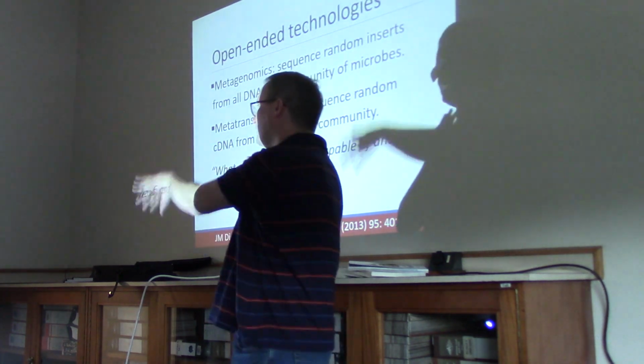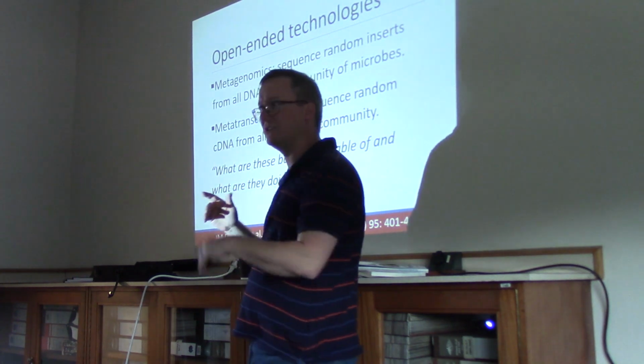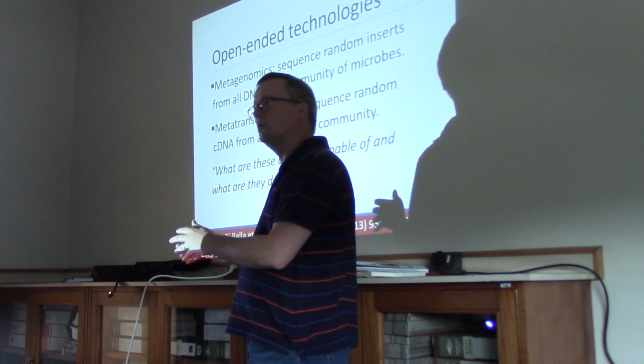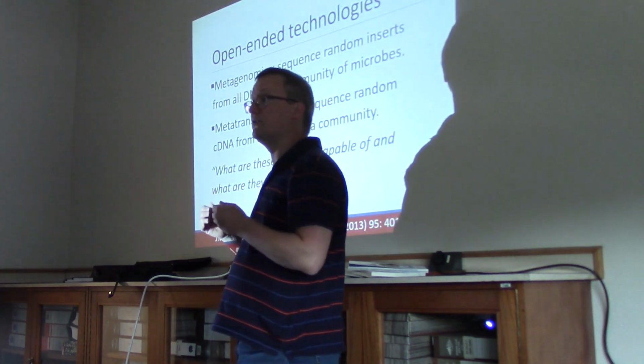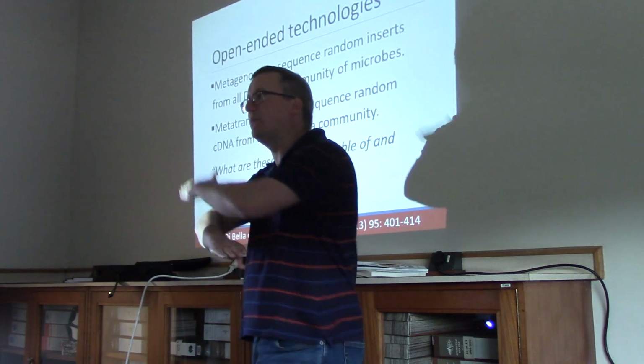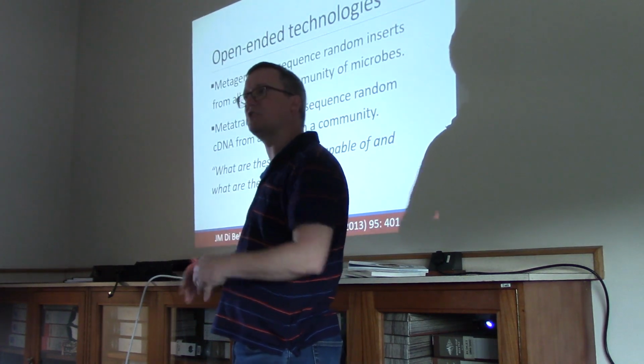So now we have the other 80% or other 50% of our reads that we still need to account for. We can do a de novo assembly from those to say, well, these sequences all overlap by all but one nucleotide. We can stitch them together.